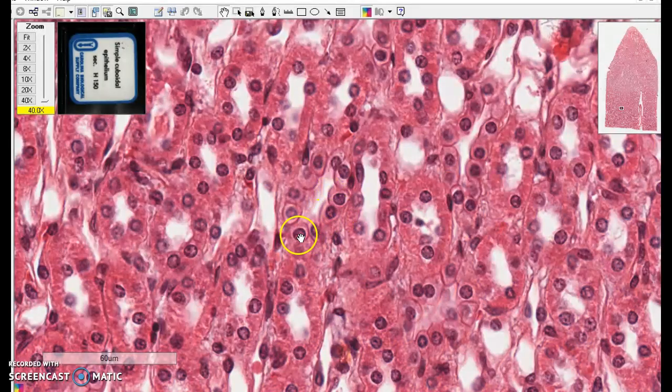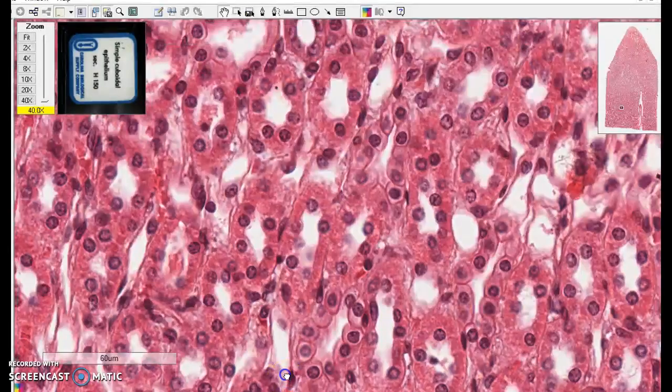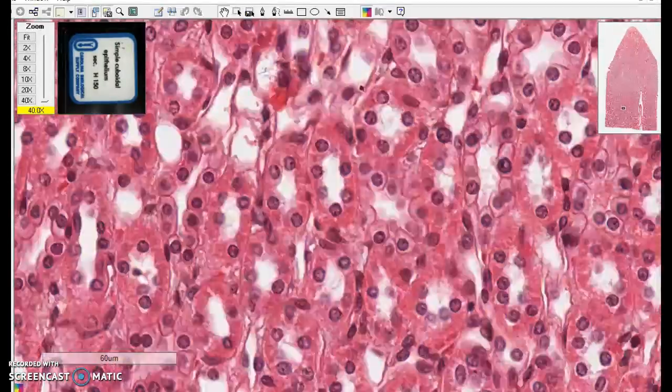And these are very characteristic looking. You can almost always see a nice fat nucleus and a little bit of cytoplasm forming these tubes. Let's look around a little bit more.